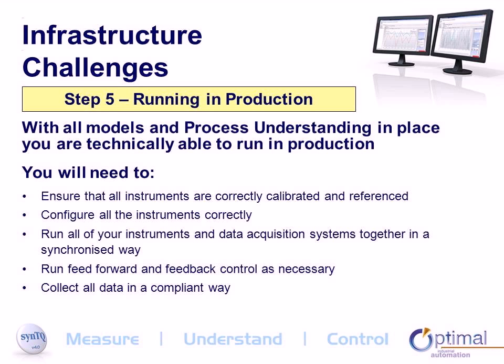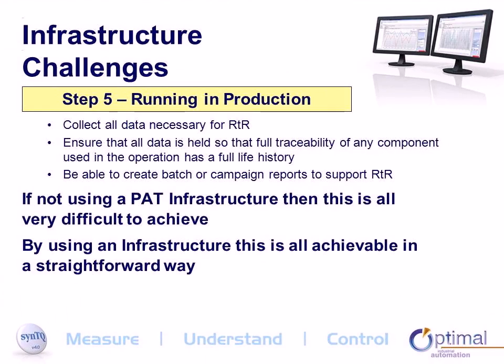And very importantly, all of the data that you collect needs to be in the correct form for real-time release if that is your target, which for many PAT deployments it is. You need to ensure that all the data is held so that you have full traceability of any component used in the system, whether that's a software component or a hardware component. So you have a full life history that can be shown to a regulator as and when required.